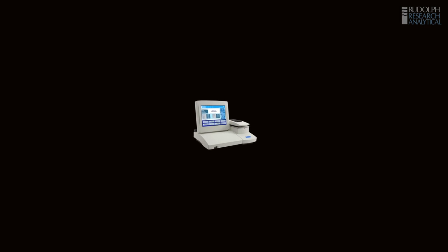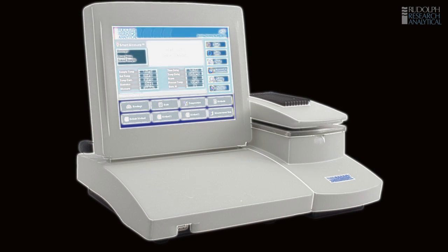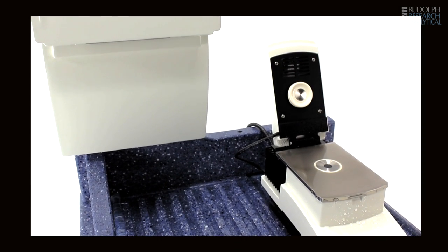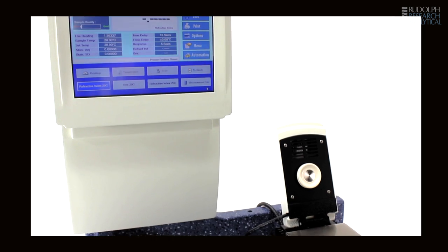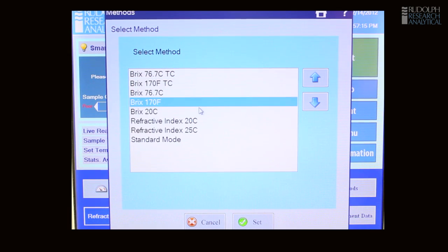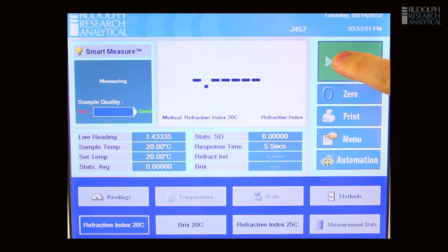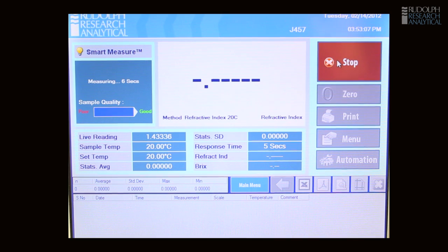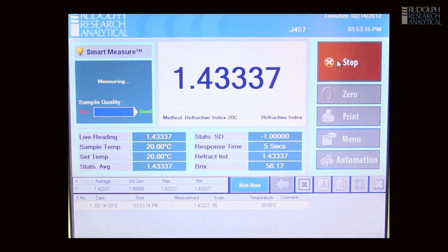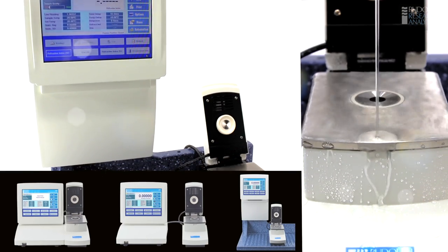The Rudolph J457's list of features goes on, making it one of the most versatile, capable, accurate and user-friendly refractometers ever produced. The quality and features of Rudolph's J457 are designed to save you time, ensure proper measurements are made, and ensure user error is reduced. Our goal is to help you increase your product quality, manage material costs, reduce compliance concerns, and save your labour expense.